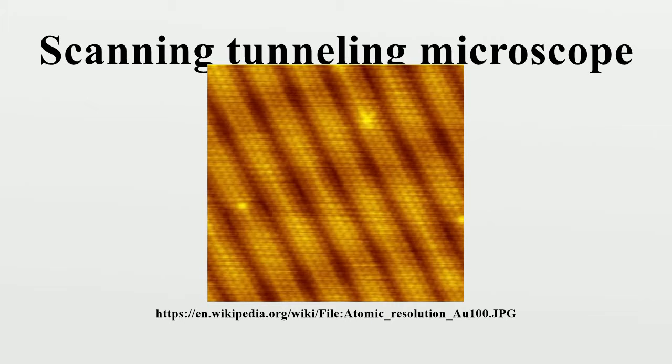Maintaining the tip position with respect to the sample, scanning the sample and acquiring the data is computer controlled. The computer may also be used for enhancing the image with the help of image processing as well as performing quantitative measurements. Probe tips: STM tips are usually made from tungsten metal or a platinum iridium alloy, where at the very end of the tip there is one atom of the material.